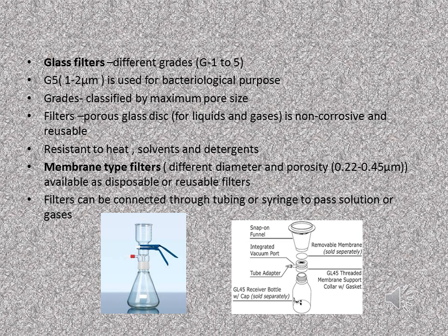The filters are resistant to heat, solvent and detergent. Membrane type filters have different diameters and porosity from 0.22 to 0.45 micrometer and are available as disposable and reusable filters. Membrane filters can be connected through tubing or syringe to pass solution or gases.